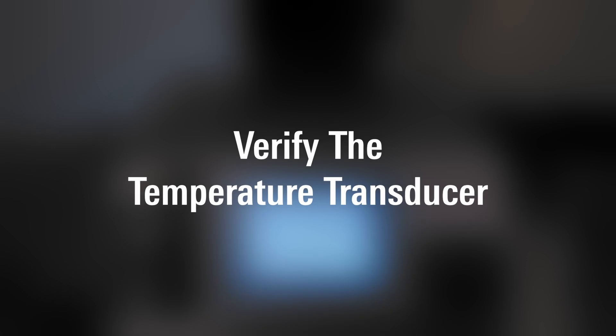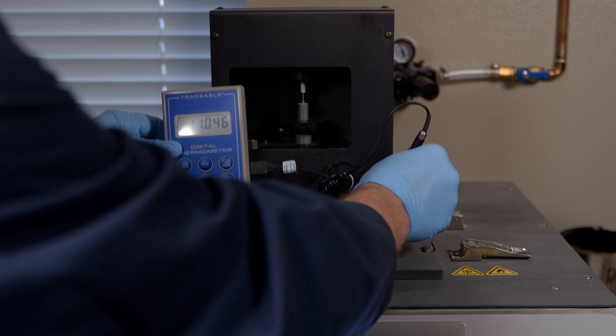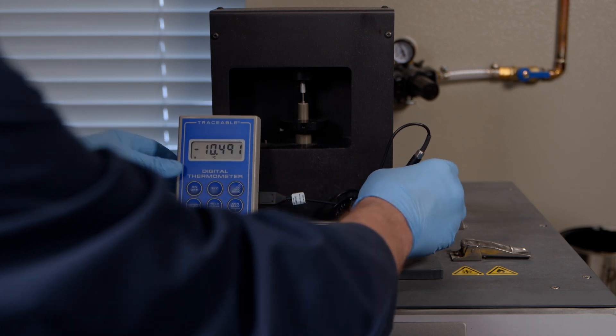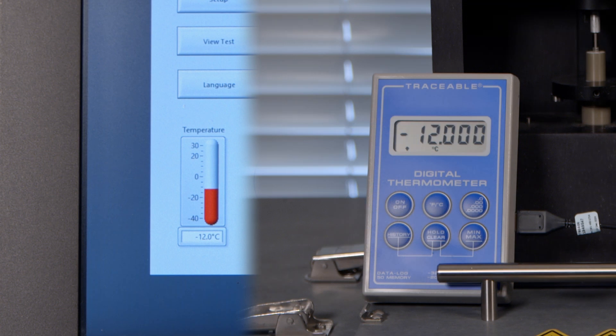Verify the temperature transducer. Daily before testing, immerse the temperature probe in the bath close to the temperature transducer and compare the probe reading with the BBR temperature reading.